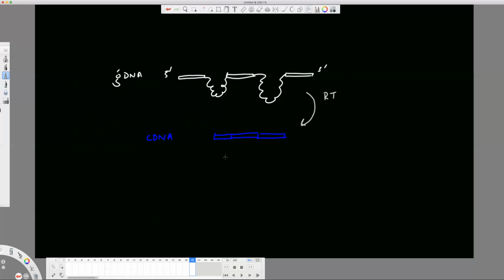Now, what I'll do is the following. I will choose one of the primers, okay? I'm going to choose one of the primers which is spanning the exon junction, and the other primer from anywhere. The second primer could be from here, or it can be from here.